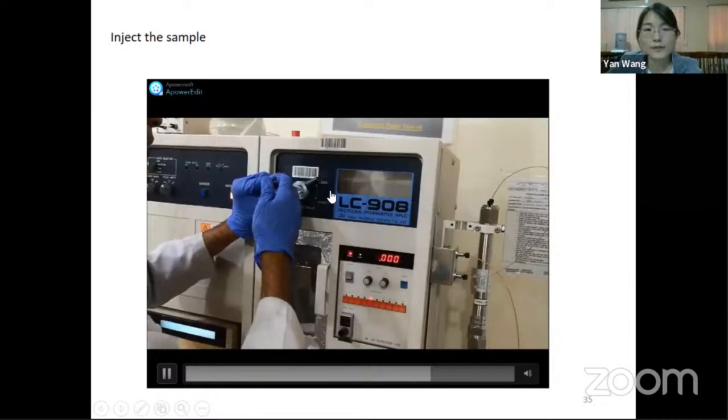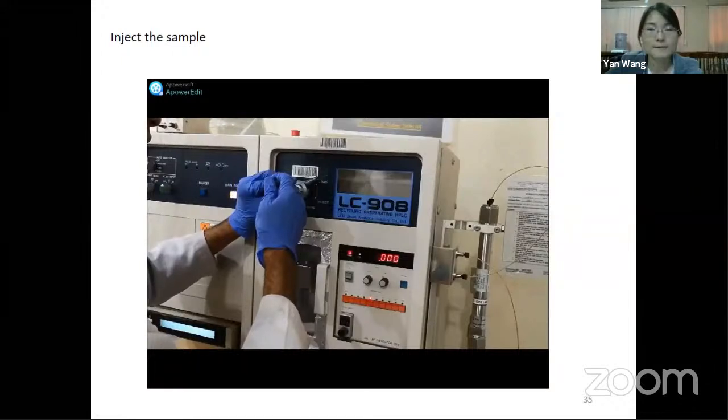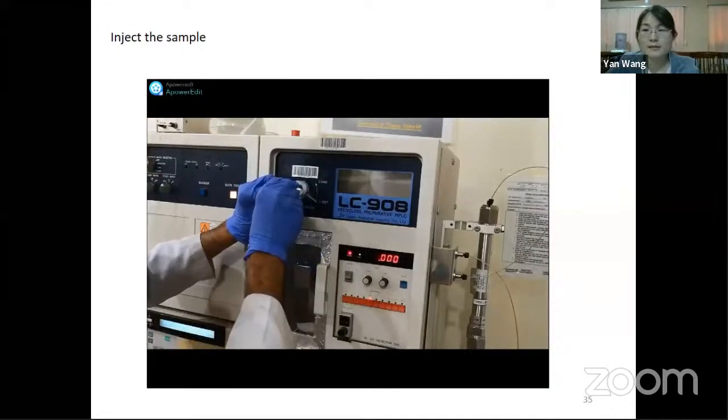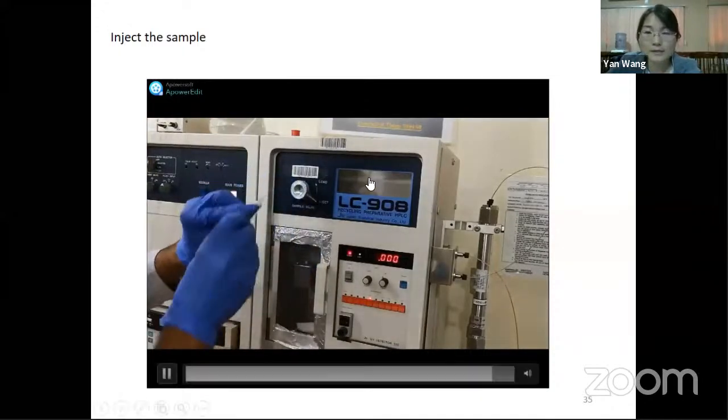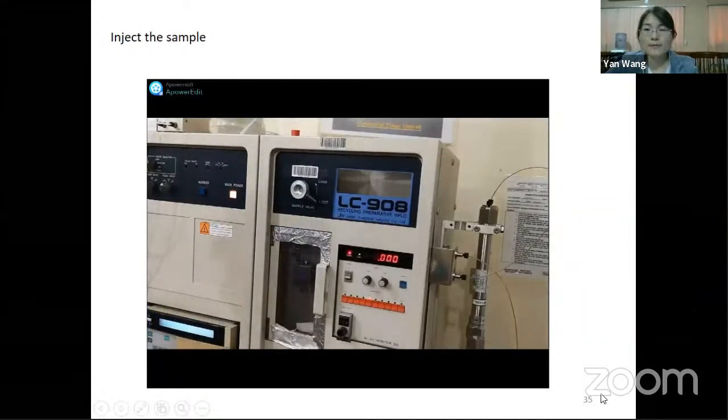Okay, it's about to finish. And now, okay, still pushing. Okay, now he's going to move. Now this mode changed. Now this loop is connected with the column. And then the sample goes from the loop to the column, right?